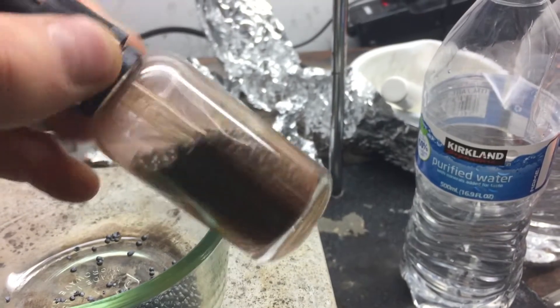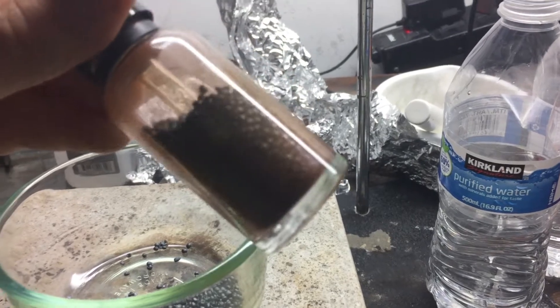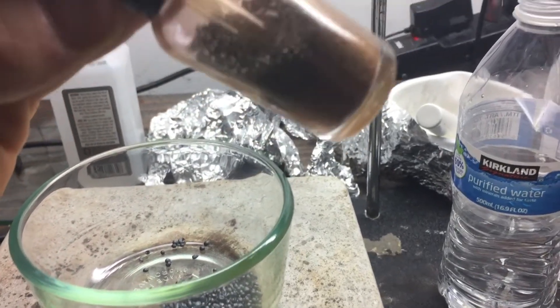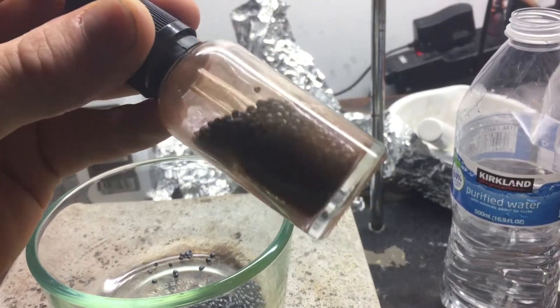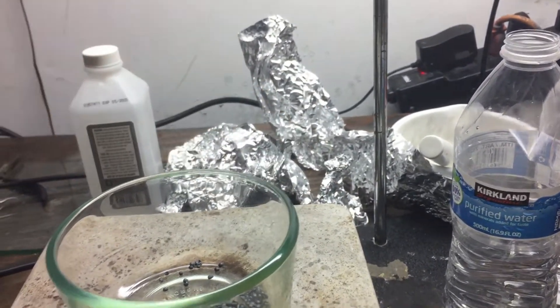Here I have a pretty decent amount of iodine and it was shipped in this container which works fairly well at keeping the iodine vapors in, but not super well, so I usually keep it in the garage.